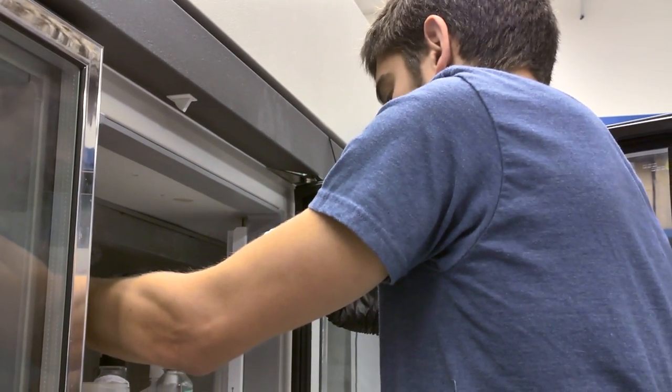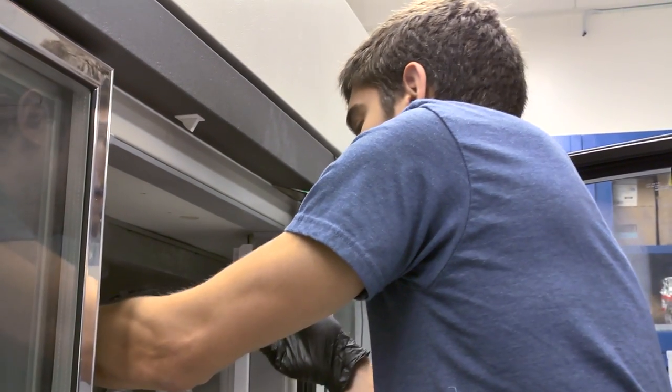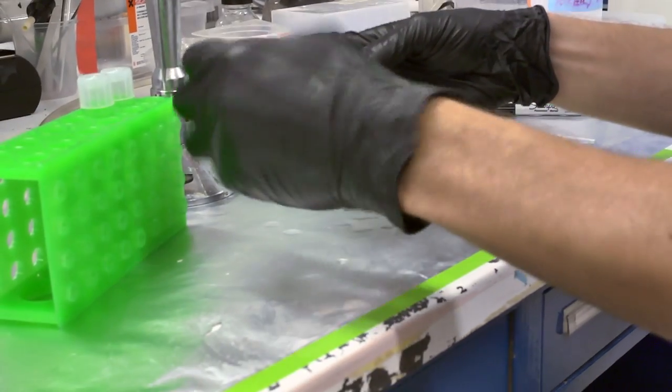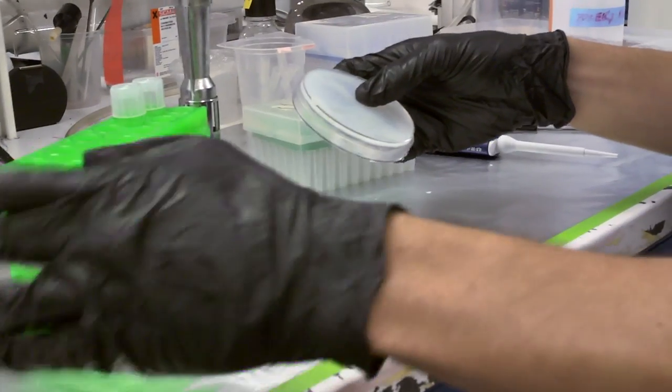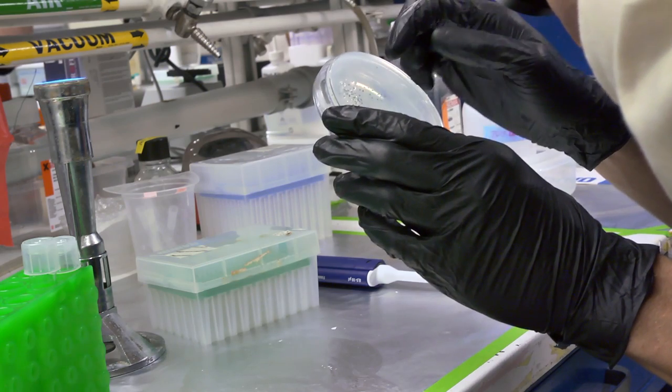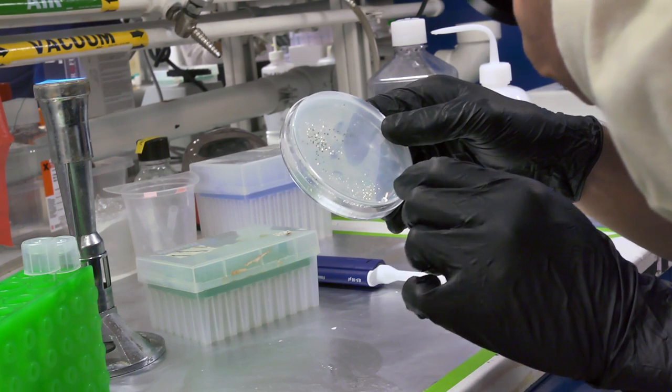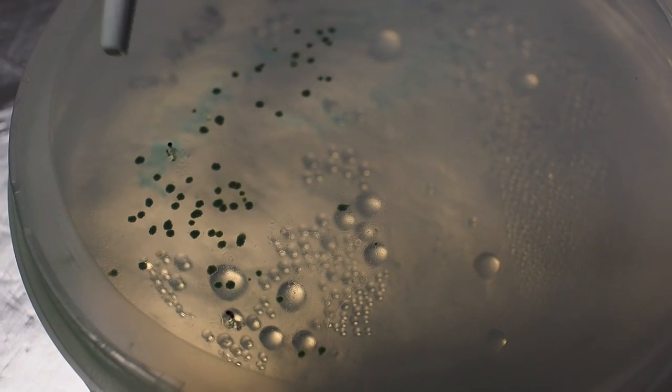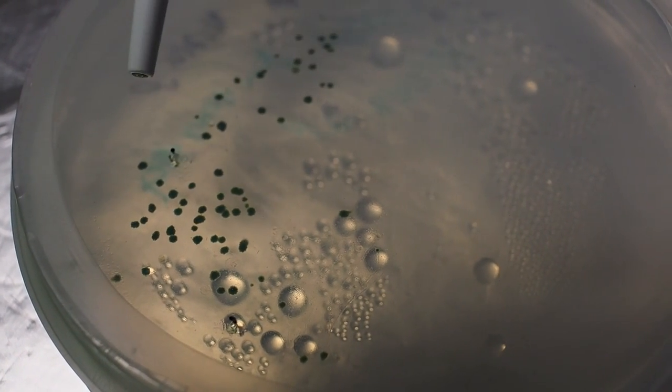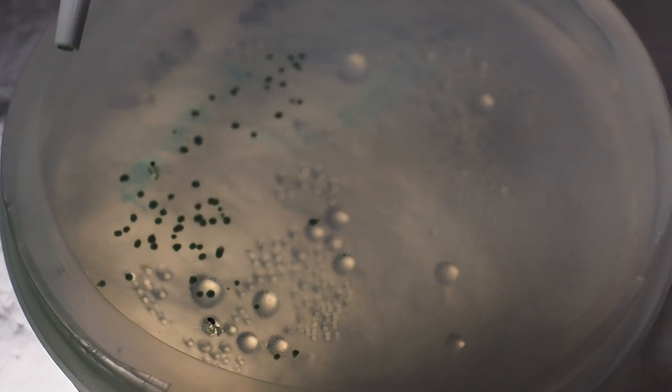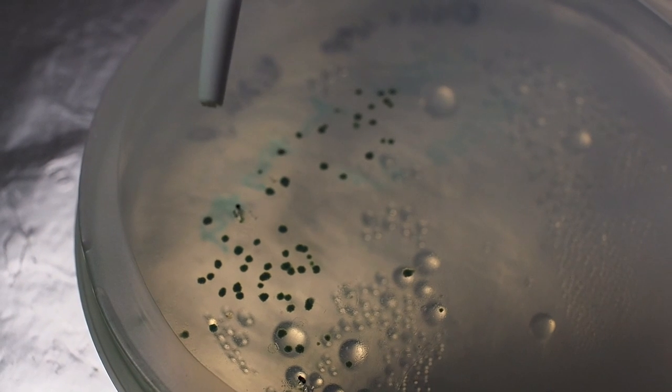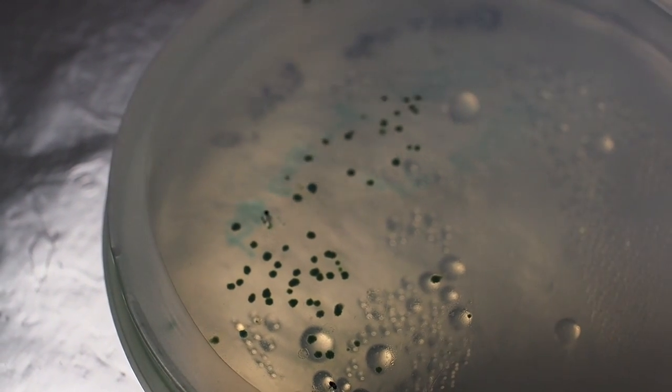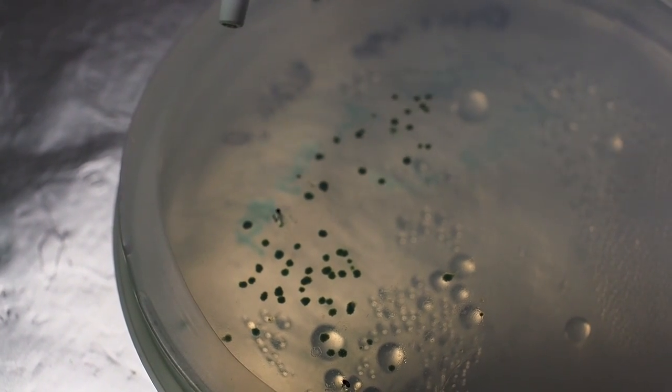Great. Okay. So here we go. Found my Anabaena plate with my little green colonies on there. I've got it wrapped up with parafilm right now, which we use to seal the plates off, help keep moisture in or out, or whichever way you think about it. This has actually got a lot of condensation built up in it. So I've got the plate here that I've put the mixed culture on, where we saw that some of them had been successfully transformed, and these green colonies have formed, which indicates that, well, one, they were able to grow on this antibiotic plate, which means that these colonies should be those strains which were transformed, and also, of course, they're green, so that assures us that it's Anabaena, and other things shouldn't be able to grow on here anyway, just because there's not enough nutrients.